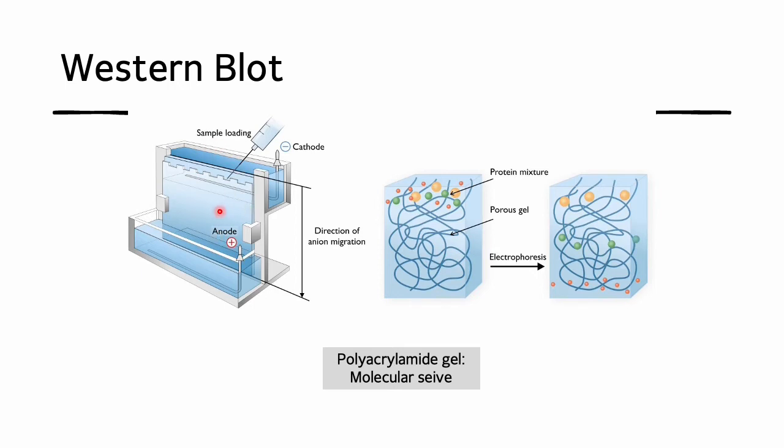The gel is more specifically a polyacrylamide gel, meaning that inside the gel there is polyacrylamide, and it performs as a molecular sieve.